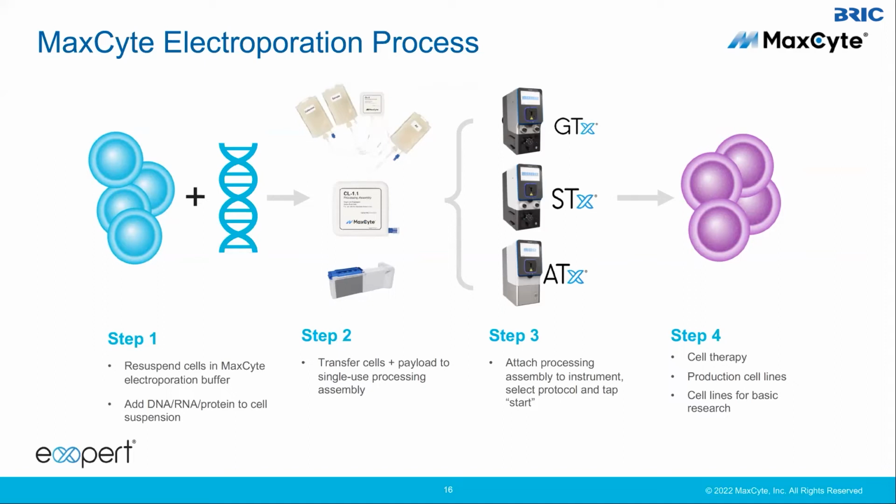If it's stable cell line establishment, maybe doing antibiotic selection, or we do have customers who, after electroporation, immediately freeze the cells or cryopreserve the cells. So there are a lot of different ways that you can use these cells after electroporation, depending on your application.